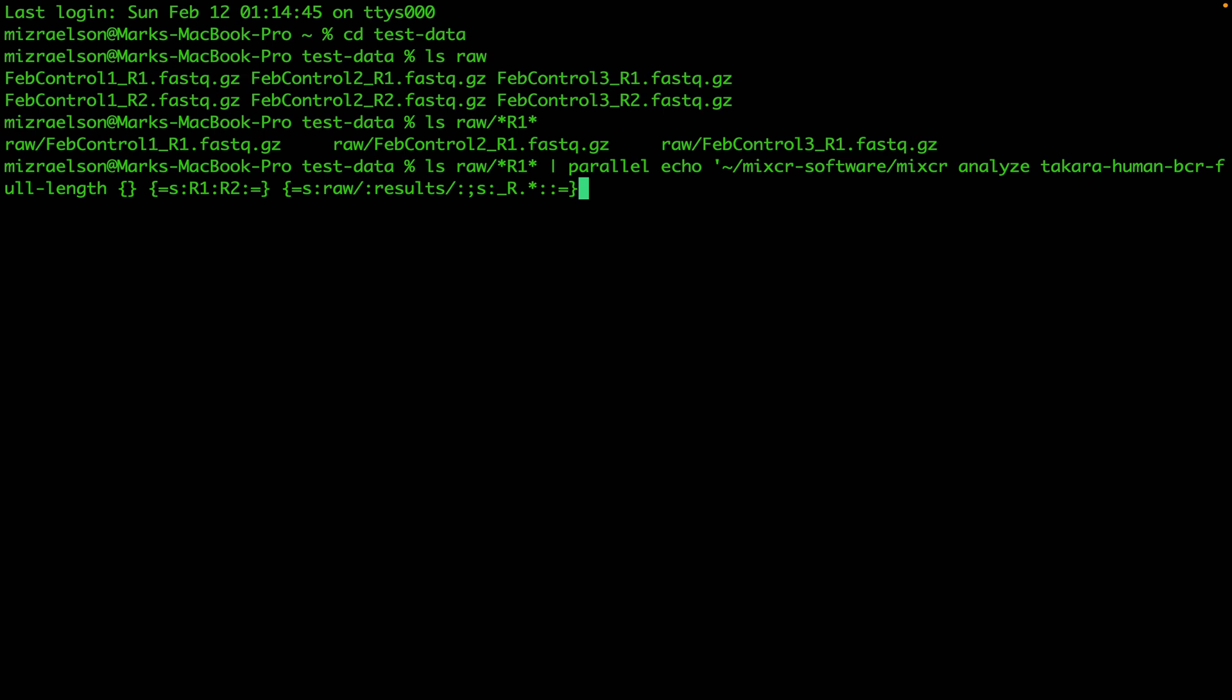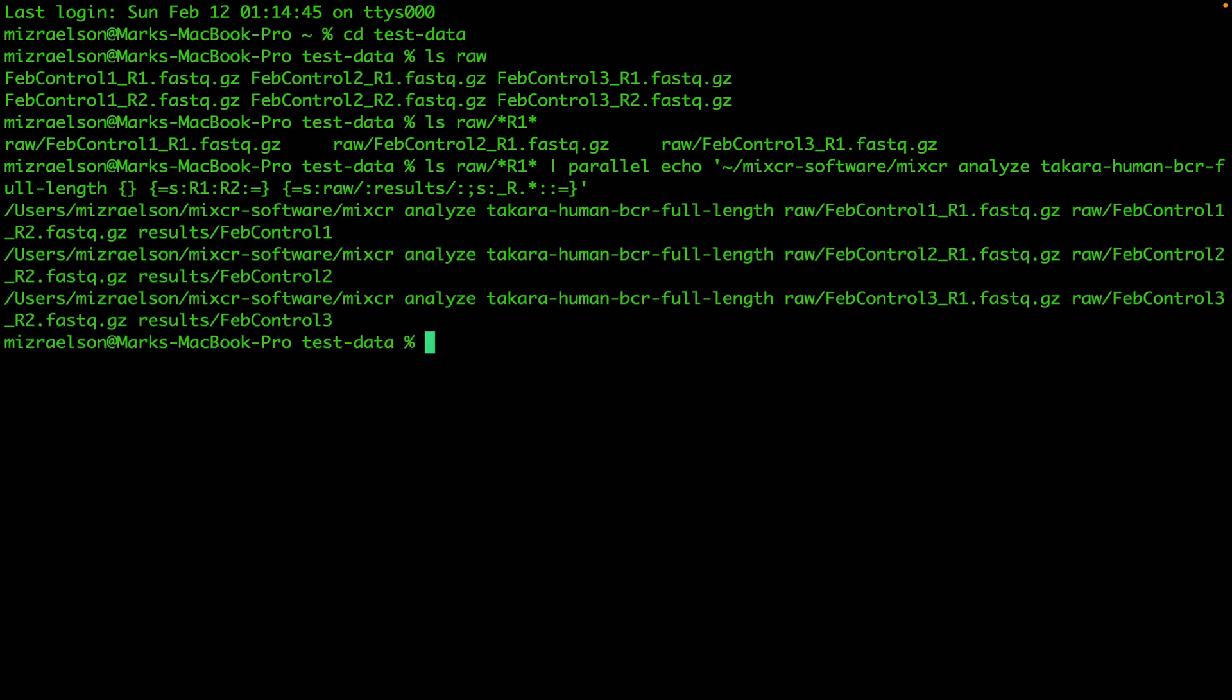I can close the quotes. Now I'll hit enter. Because we had echo here, instead of running these commands, parallel prints all the commands that it's gonna run. That is really good practice and I recommend you to use echo every time you want to use parallel before actually running the command, so you can check for any typos or mistakes.